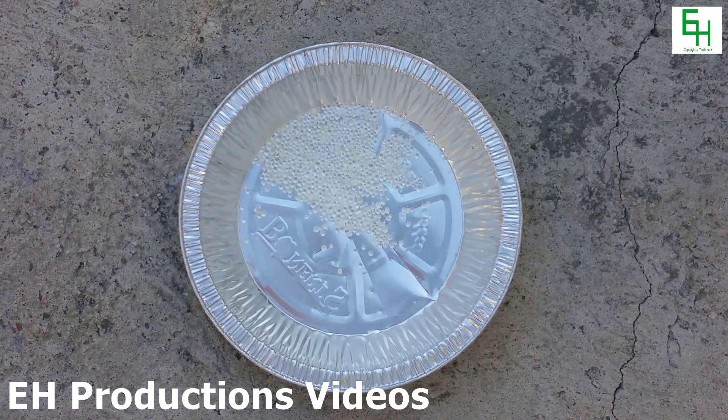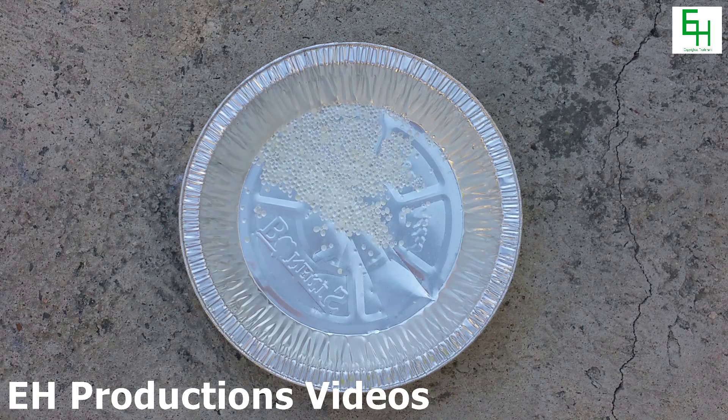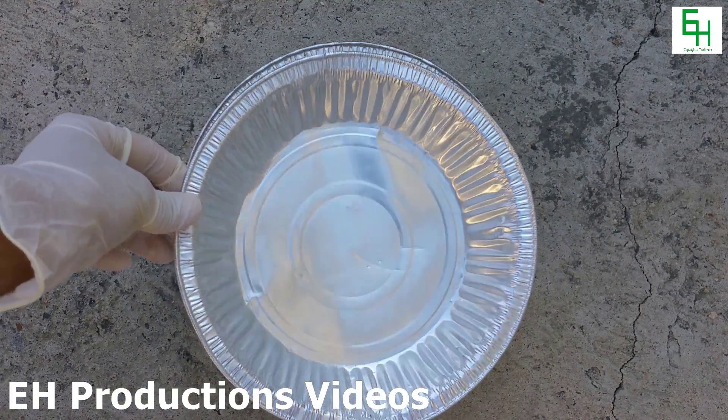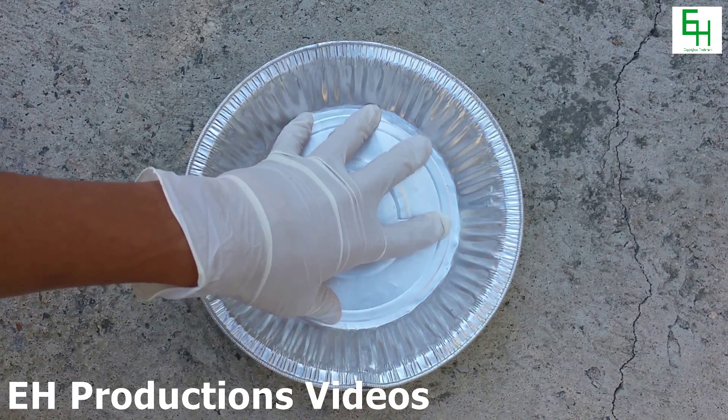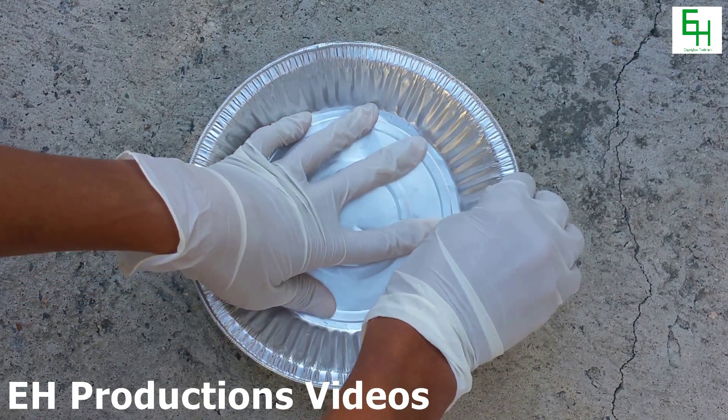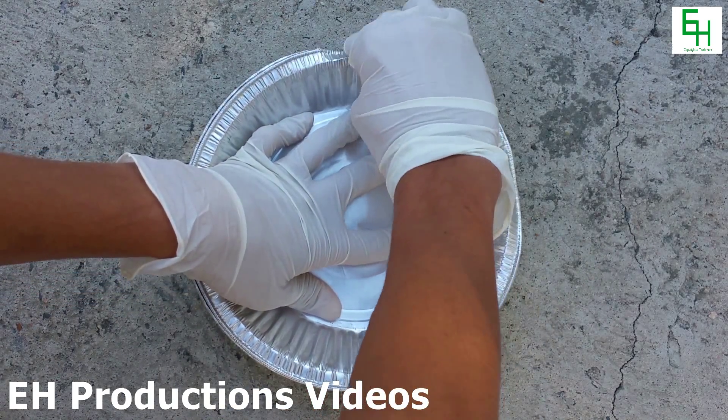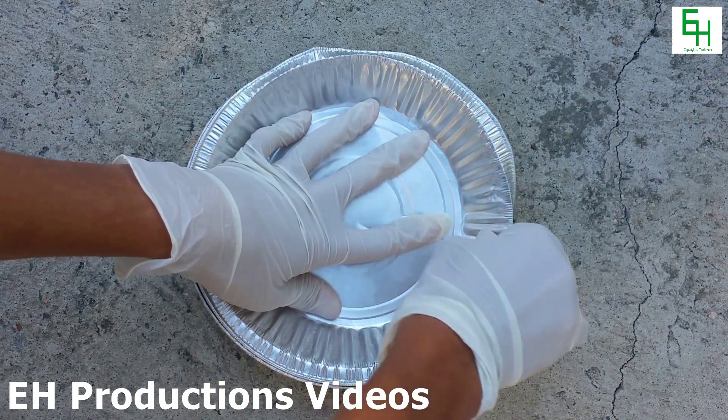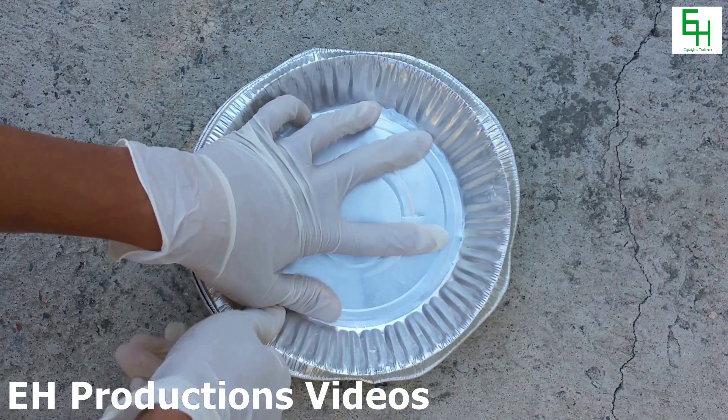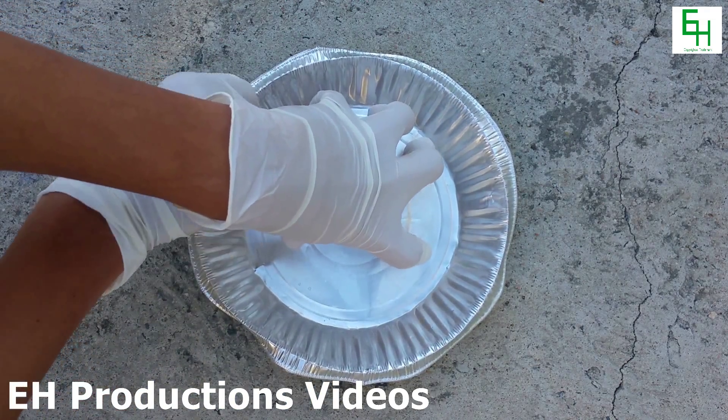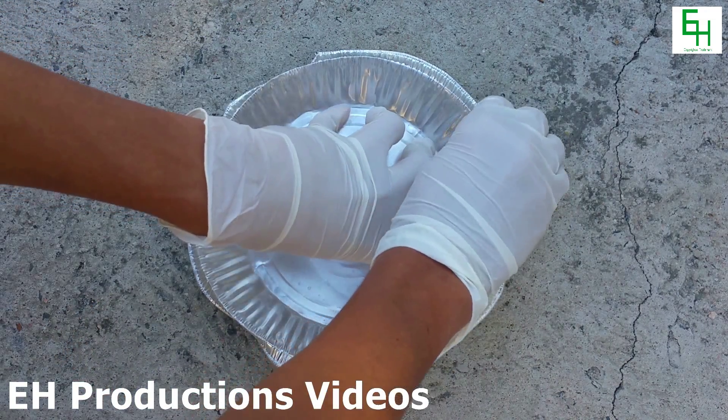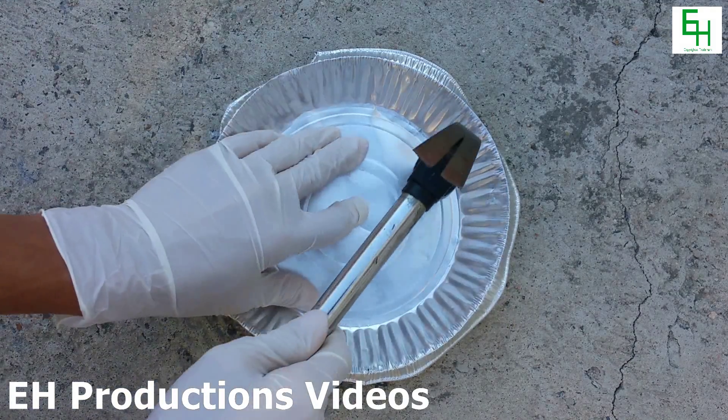Alright here it is on the floor and what we're going to do is we're going to put another aluminum pie pan over it approximately the same size. Well this one's exactly the same size. And we're just going to close it like this. Just slightly close it so none of the silica gel flies out. And now get a hammer and we're going to pulverize this.